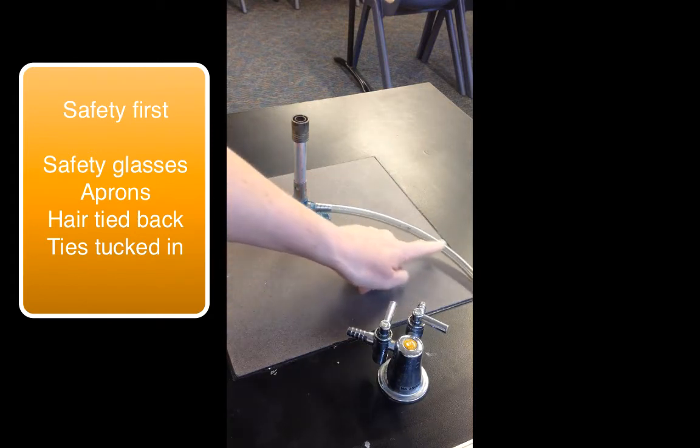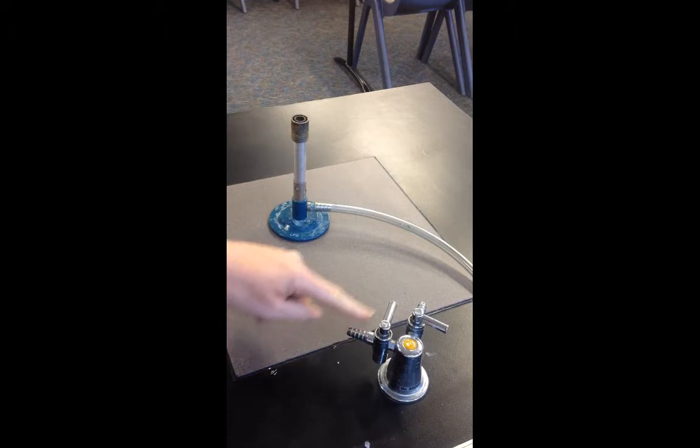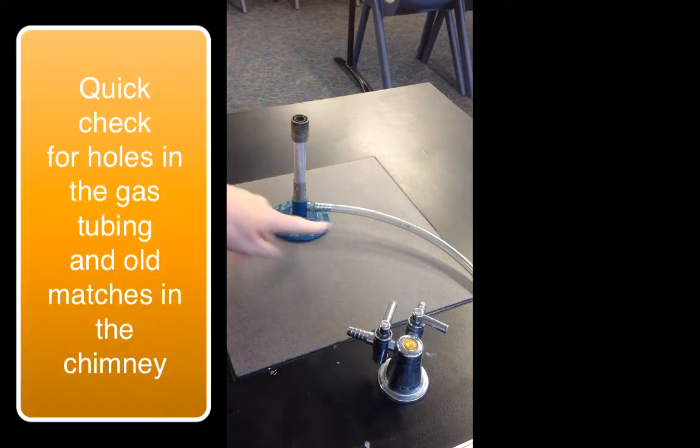This part of the Bunsen burner is the gas tube. It will connect to a gas jet. This is the base of the Bunsen burner. And this is the chimney — this is where the flame will come out. On the chimney there is a collar.